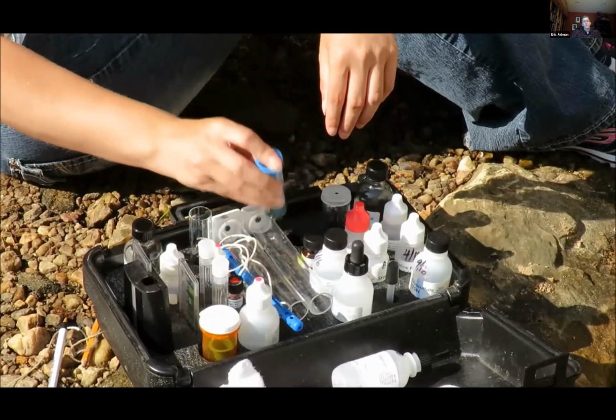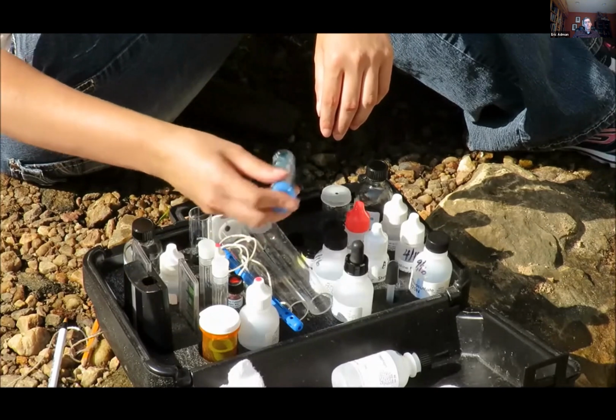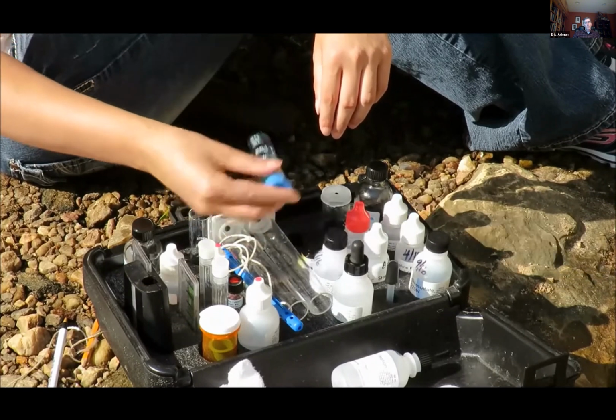A blue-green color will develop. If a pink or pink-gray color develops, there is no measurable alkalinity and the value should be recorded as 0 milligrams per liter.